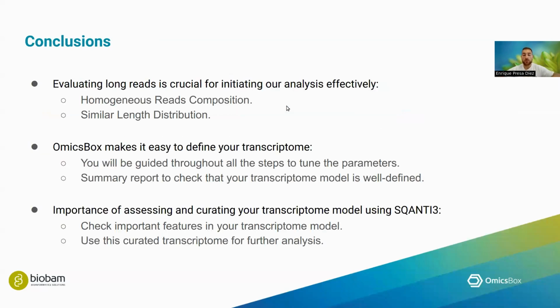Now to finish, I want to share with you some conclusions. First of all, the assessment of long reads is really important to initiate our analysis effectively. It is important to look, for example, at the length distribution or that the read composition is homogeneous. Also, we have seen that OmicsBox makes it really easy to define your transcriptome because of the wizard.